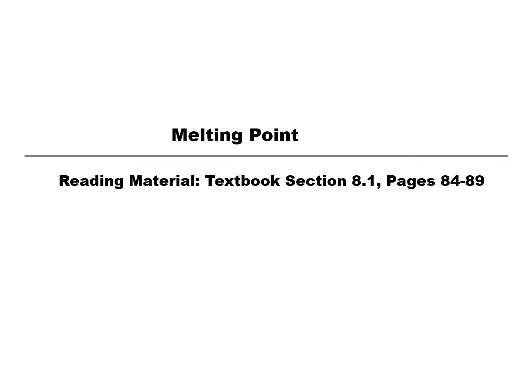Hello there, and today we'll be looking at the second experiment topic, which deals with melting point.